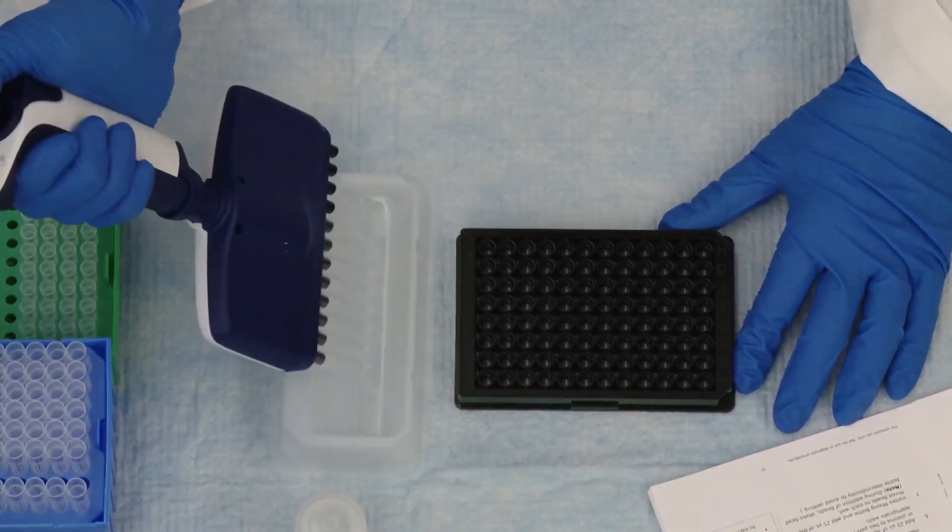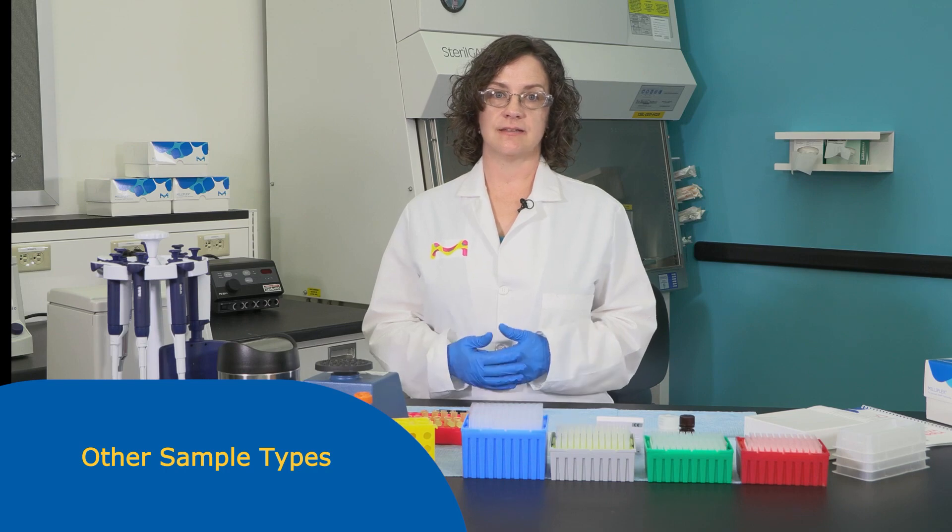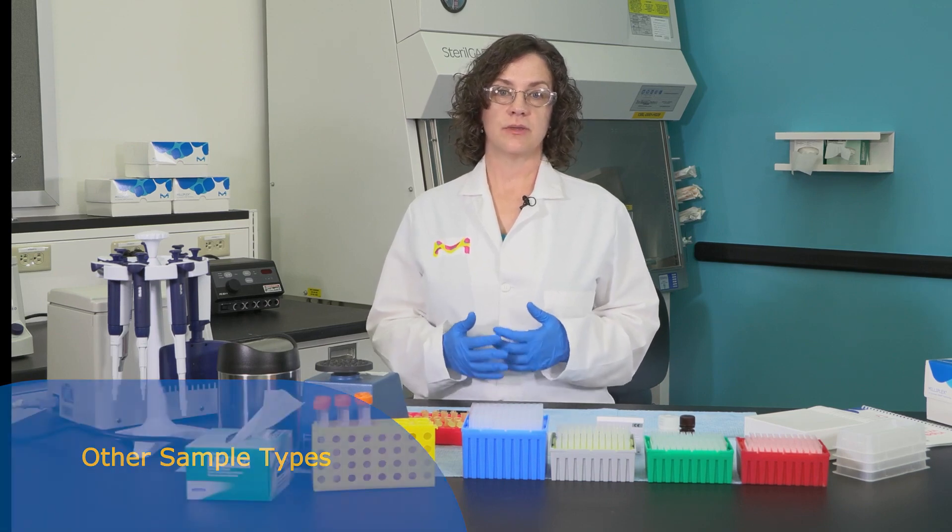We offer select kits which were developed and tested for use with other sample types such as urine, cerebrospinal fluid, and cell lysates. For these kits, please refer to the kit protocol for specific sample preparation procedures.